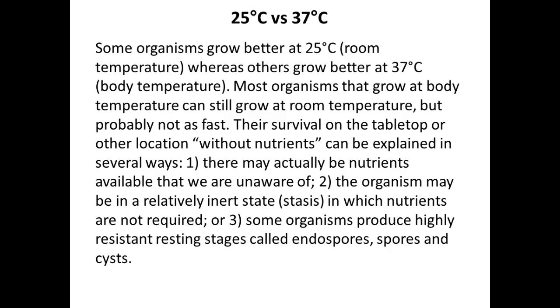So our desktops, right? You're definitely going to see organisms. And again, because we're going to put them nice and warm, we're going to give them lots of food, right? So they're there, but again, there are nutrients there, but they're not growing to huge enough numbers that you can see them without the aid of microscopes. Also, microorganisms are really good at starving, or going into states of stasis where they're not metabolically active and don't need a lot of nutrients.